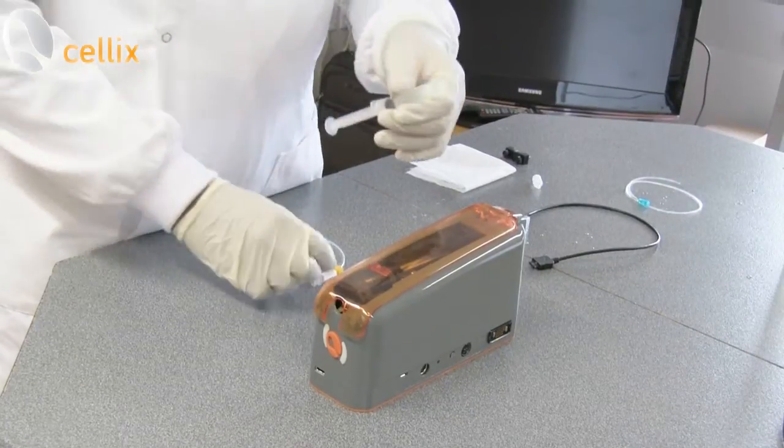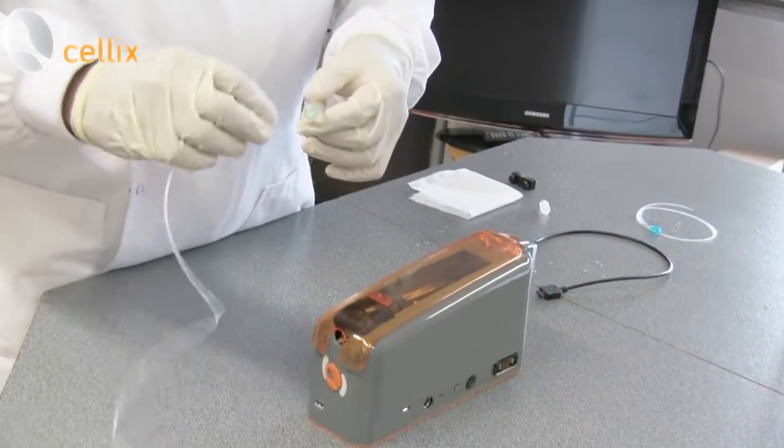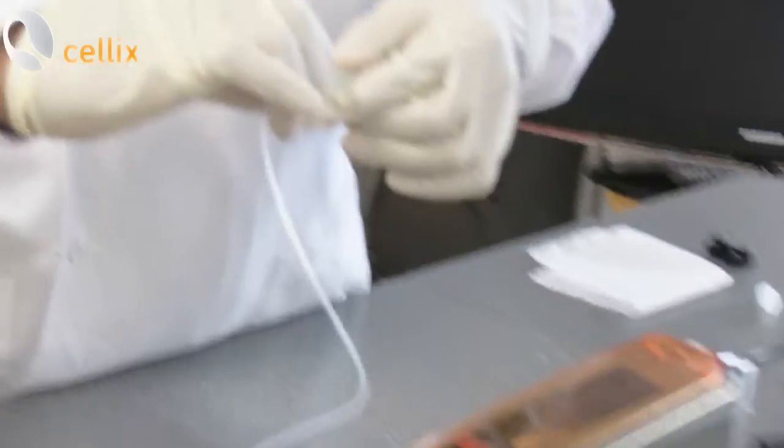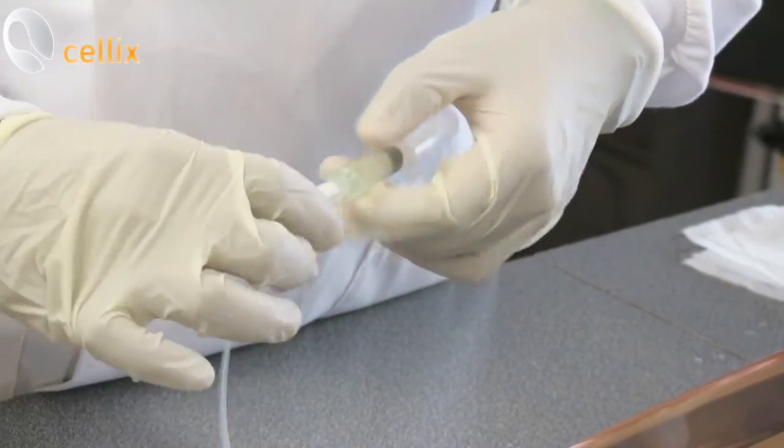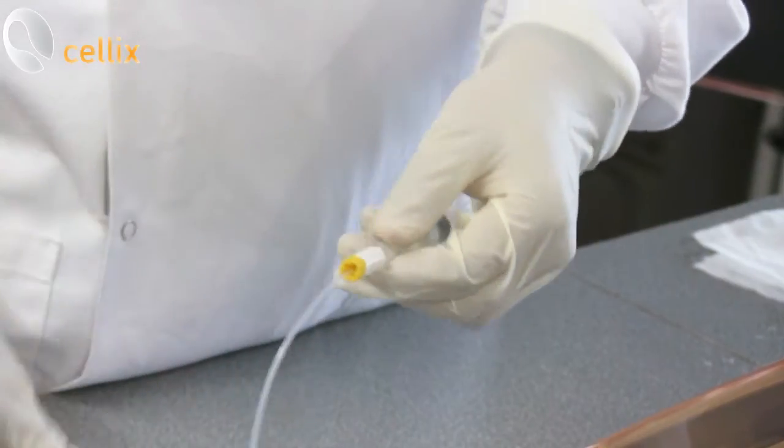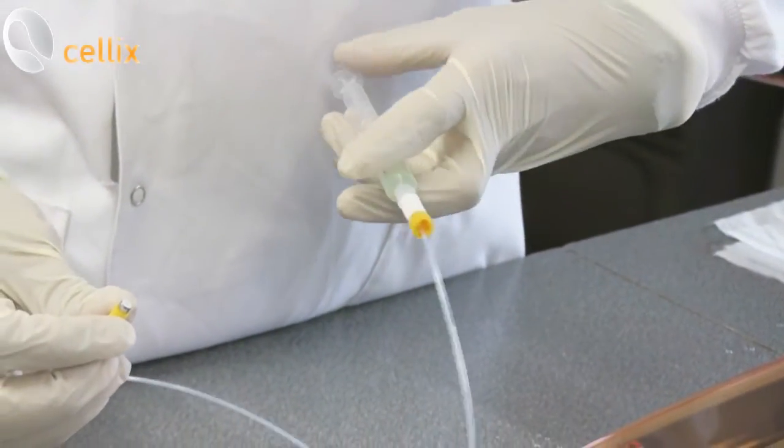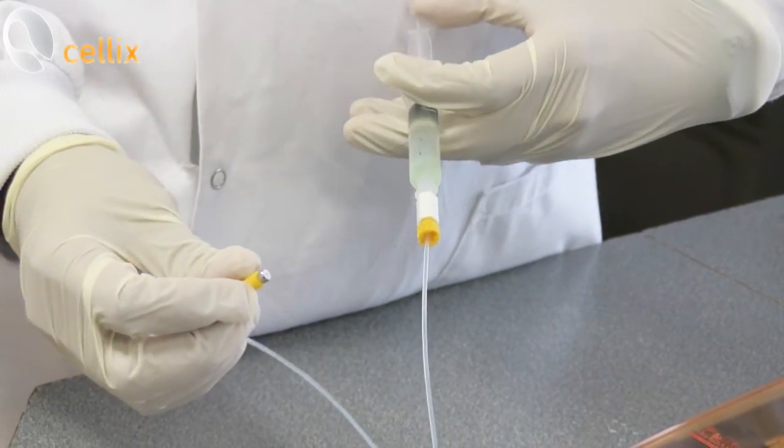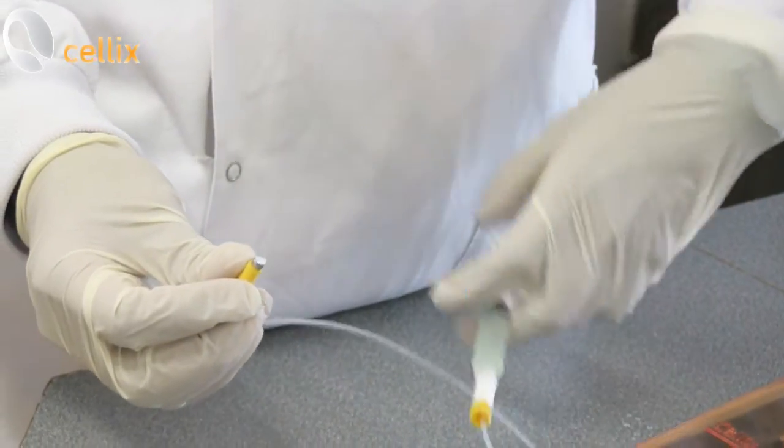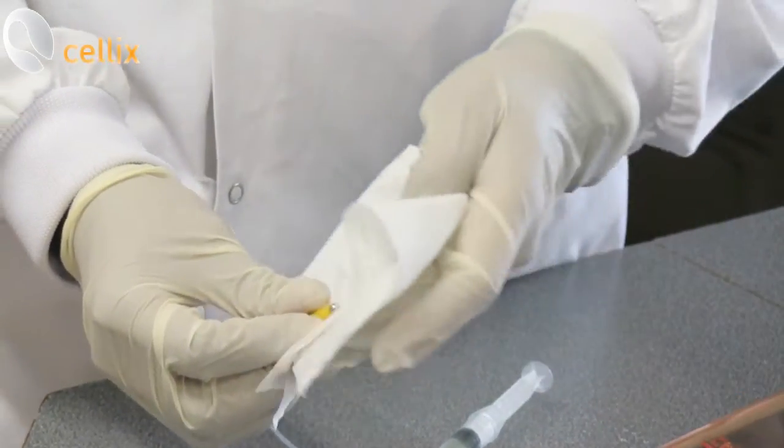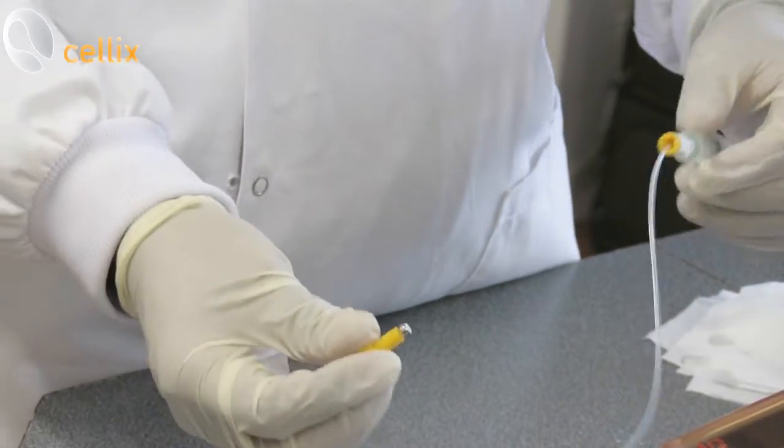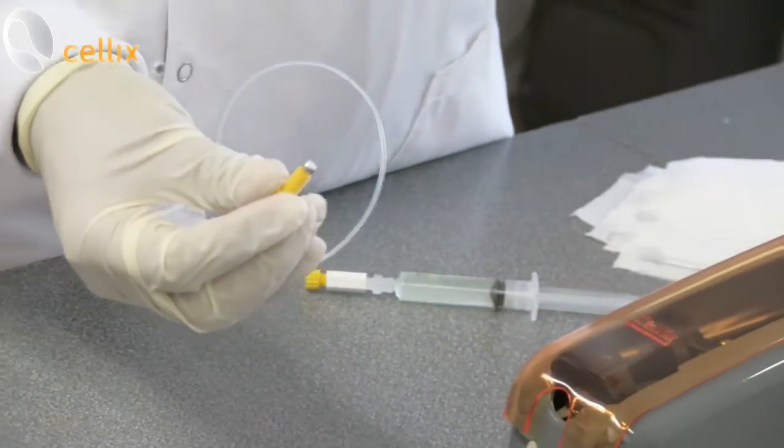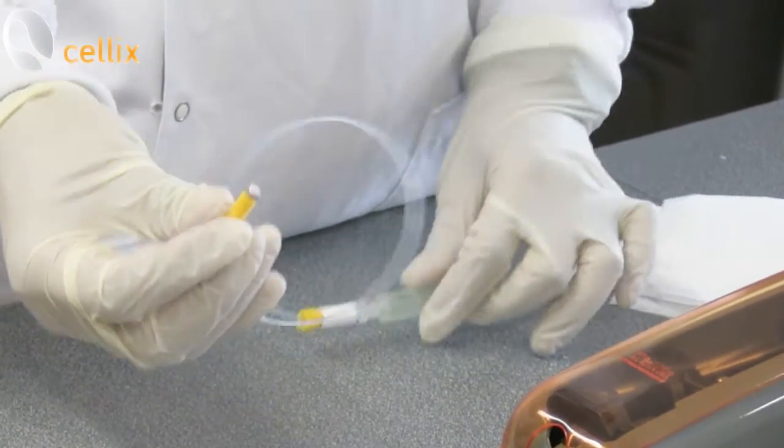This is a sample. You take this tubing and make sure the connections are tight. You usually need to remove the bubbles, so gently fuse some liquid. Now it's pre-filled with your sample.